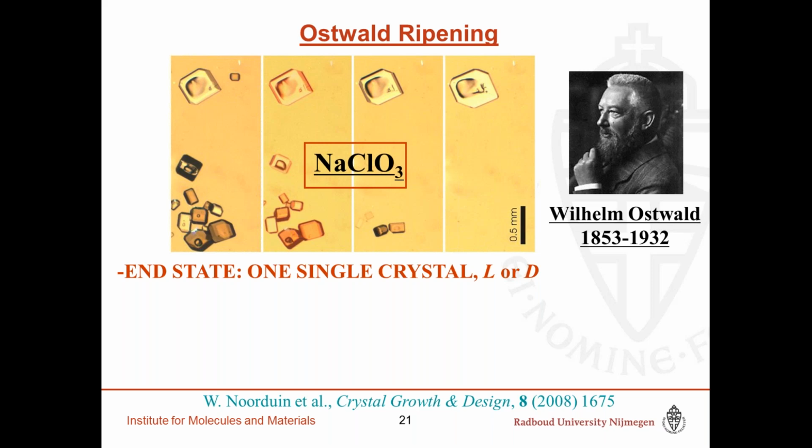What we're trying to do now is, for the case of the co-crystals, for instance, to see whether we can find families of molecules. So a family would mean molecules which differ mutually, but not in too many groups.